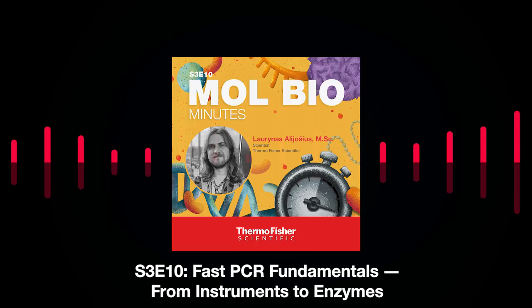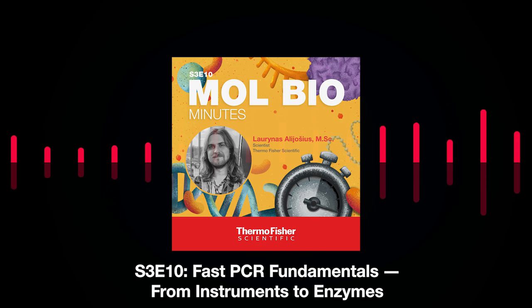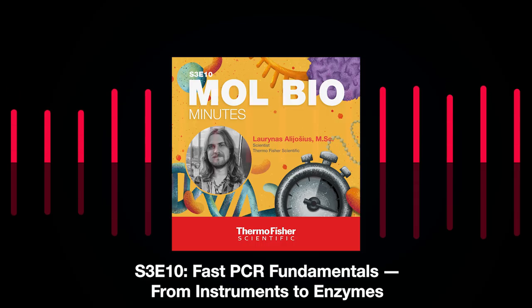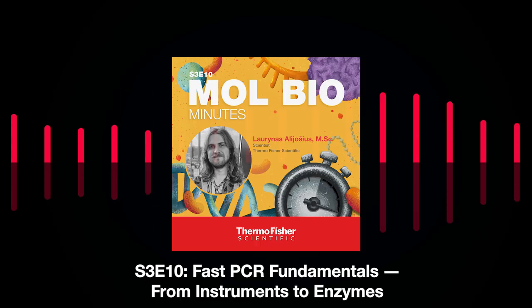What are we gonna do here? Can we just skip the dinner or skip the PCR? Or can we do maybe both? And we actually can, I'm gonna assure you. There's a way to do it, and that's where the fast PCR mode comes in to save your dinner with your friends. So let's talk about fast PCR.